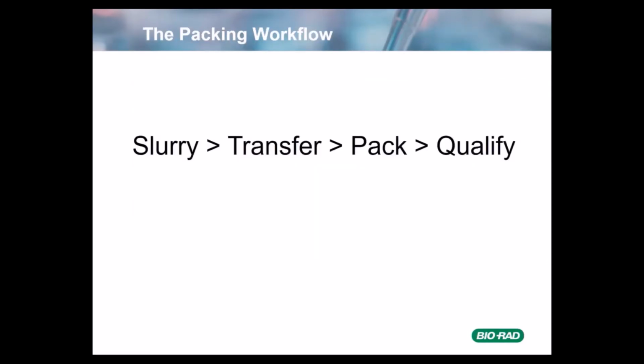So this is the workflow for packing. You make the slurry, transfer the slurry into the column unless you're making it up in the column, pack, and then qualify.